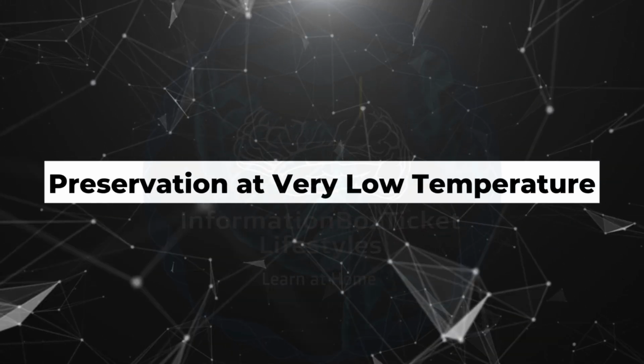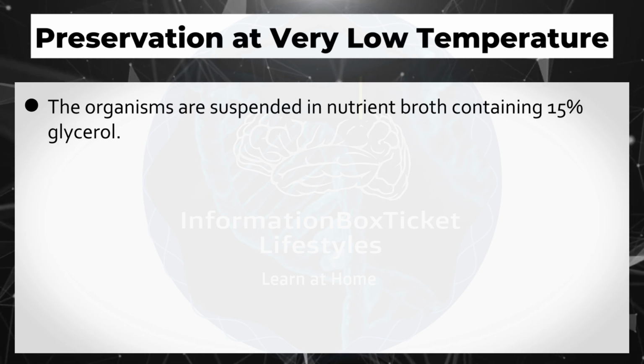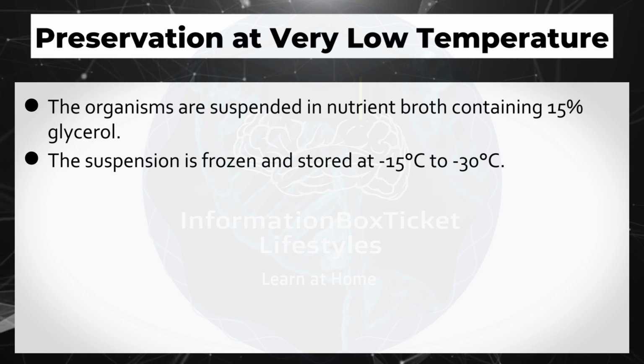Preservation at very low temperature. The organisms are suspended in nutrient broth containing 15% glycerol. The suspension is frozen and stored at -15 degrees Celsius to -30 degrees Celsius.